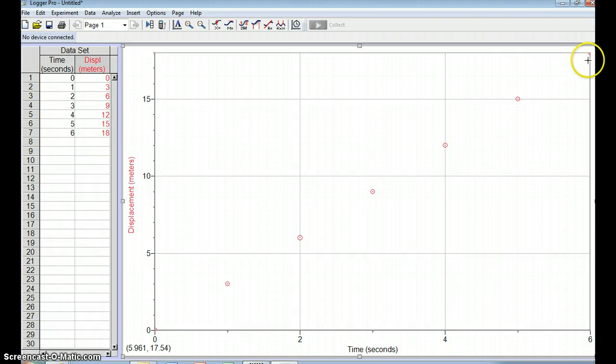However, one of the problems is it does take the last point, and it's kind of hidden way up here in this corner. And in this case, the origin is also buried down here in the lower left corner. So sometimes auto-fit is not the best thing because you might lose your first and last bit of data.